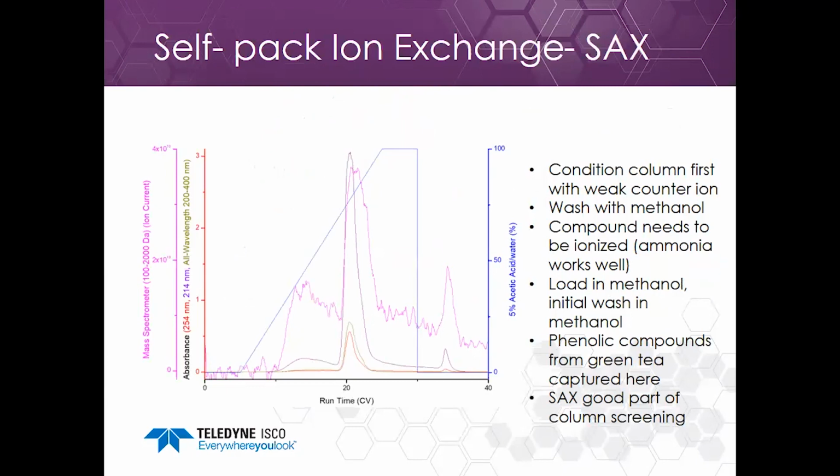Self-packed ion exchange. This is a strong anion exchange, and you can use that to purify acidic compounds.